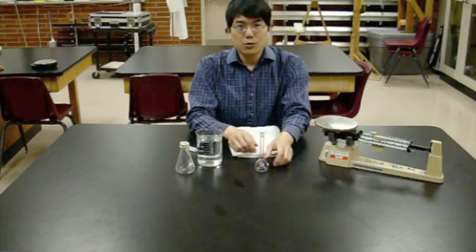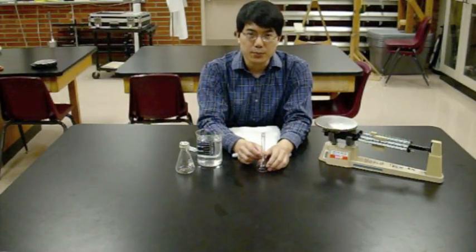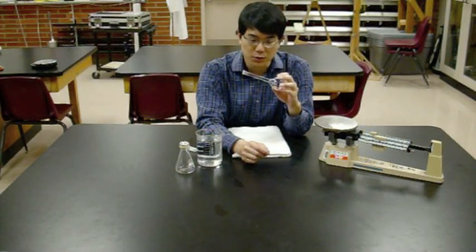The other thing to remember is that you want to measure the mass of 50 milliliters of water, not the mass of 50 milliliters of water plus the glass that makes up the volumetric flask. So we're going to have to subtract out the mass of the volumetric flask.